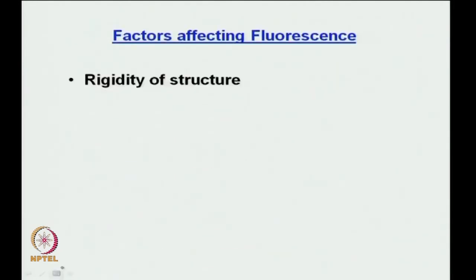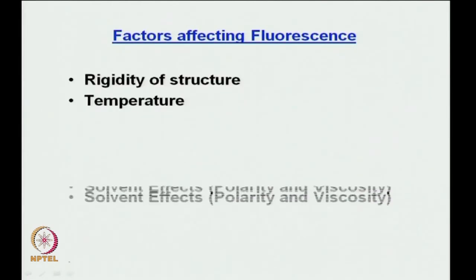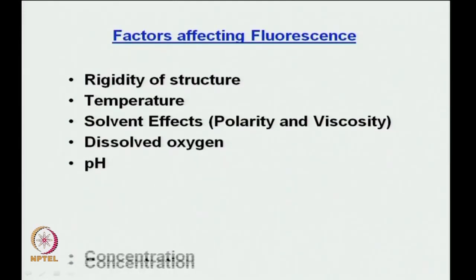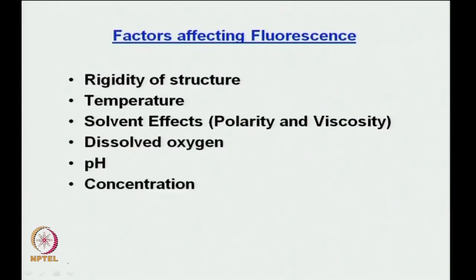So what are the factors affecting fluorescence? One is the rigidity of structure, the other one is temperature, solvent effects, polarity, viscosity, dissolved oxygen, this we have discussed, pH, concentration, and many other factors. But these are the broadly defined factors that we can look into.